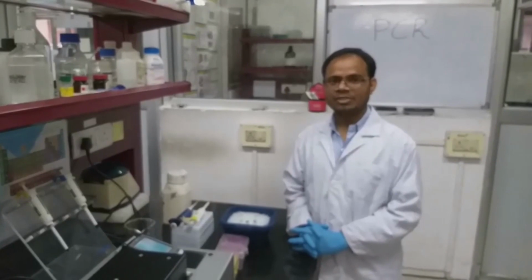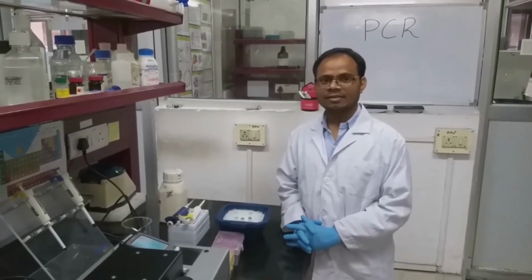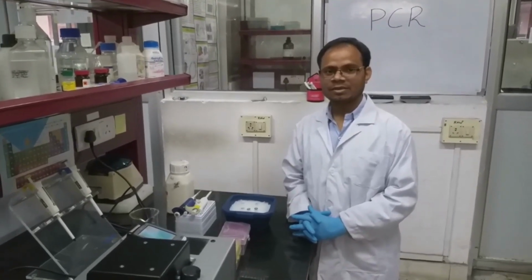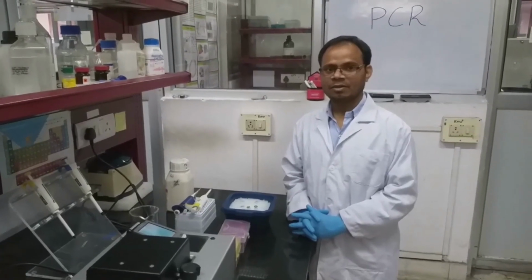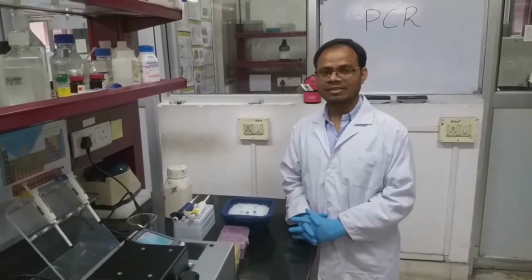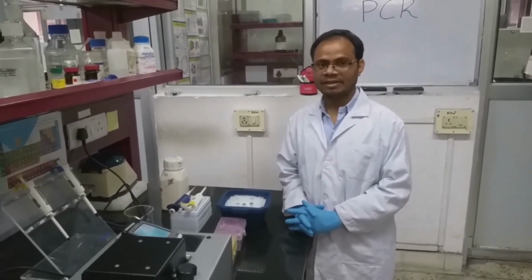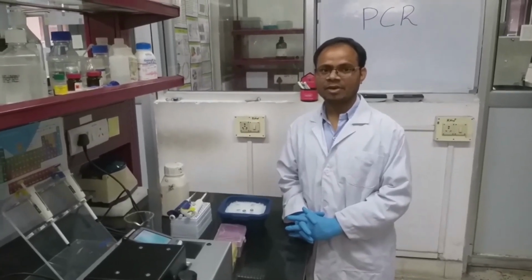To set up a PCR reaction, we need template DNA, site-specific primers, dNTP mix, nuclease-free water, and Taq polymerase. For a 50 microliter reaction, in typical concentrations, 10 to 100 nanograms of template DNA is used and 5 picomoles of each primer will be used.